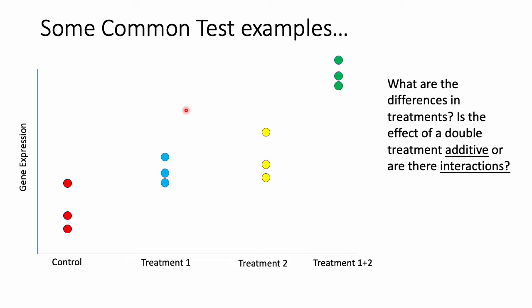Or, our experimental setup may contain a double treatment. Here, we'd want to figure out if the two treatments behave additively or if they have a synergistic effect when used together.